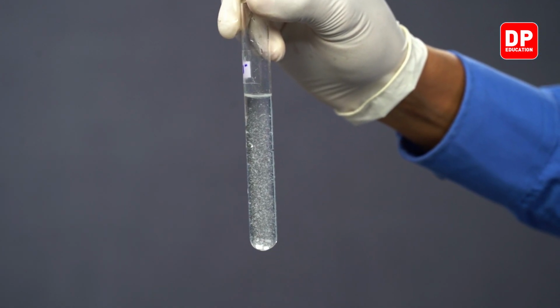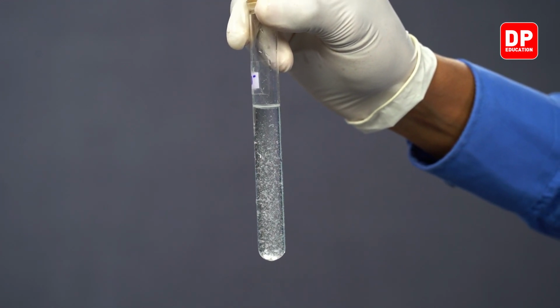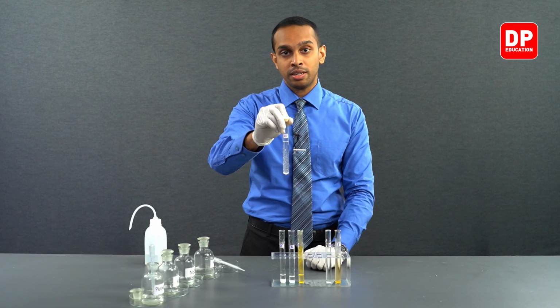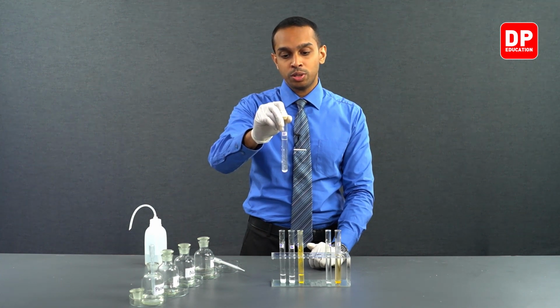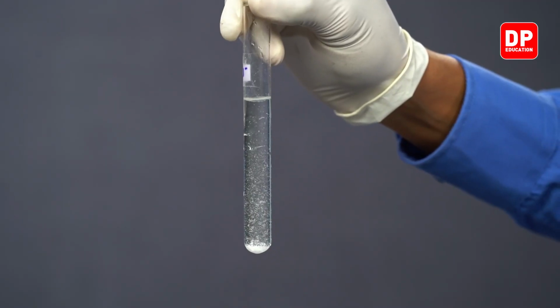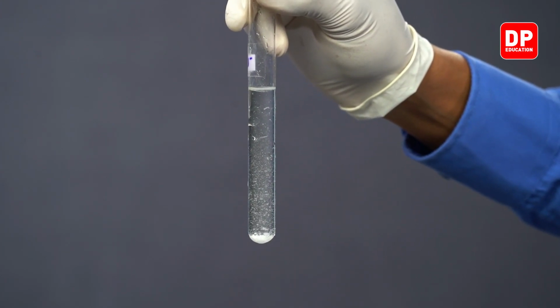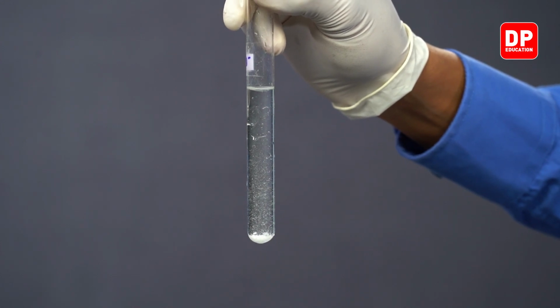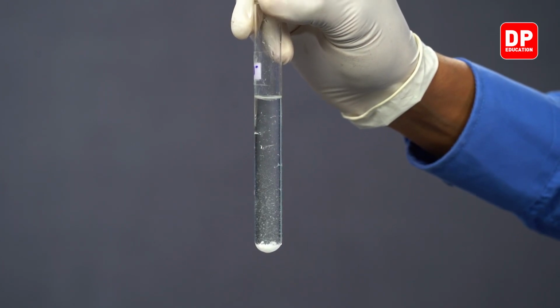If I let it stand a little bit longer, we can see the entire precipitate being formed and sedimenting at the bottom as a white color precipitate. So upon cooling, the hot PbCl2 solution, which was a clear solution, forms PbCl2 solid, a white color precipitate.